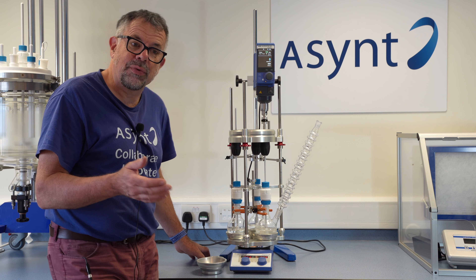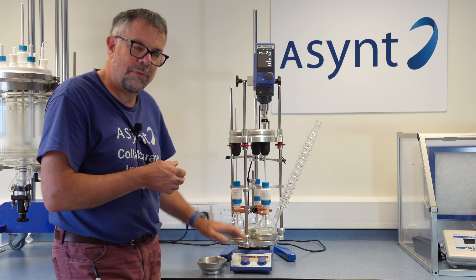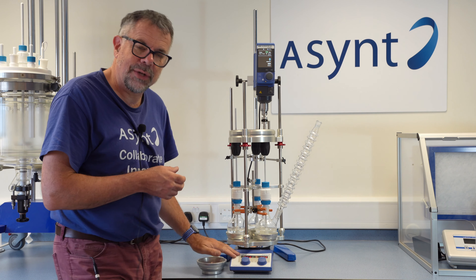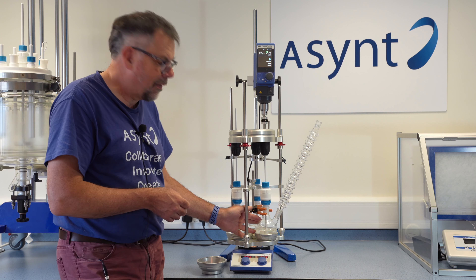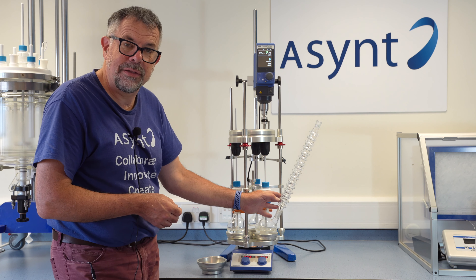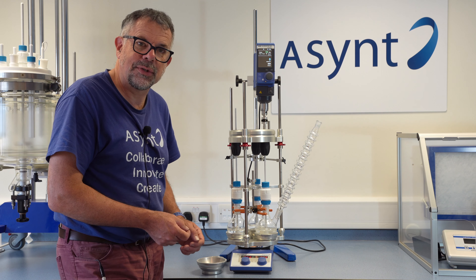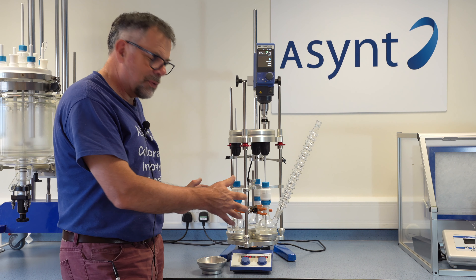Key things to remember about Vortex: use your already existing overhead stirrer and your already existing magnetic hotplate. You can use your standard glassware and standard condensers — in this case one of our condensers, but you could use a water condenser if you wished. It's very easy to use and familiar, but from that point on you've got parallel overhead stirring in a small space.